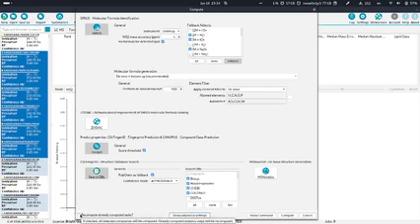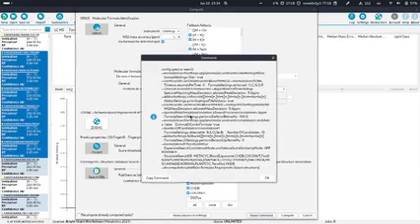What we might have to use later: if you have already done some computations and you changed something, you probably want to recompute with the new changes, and for this you have to make sure that this box at the bottom left is enabled, which recomputes already computed tasks. What is also very helpful in many cases is this button at the bottom which says show command.